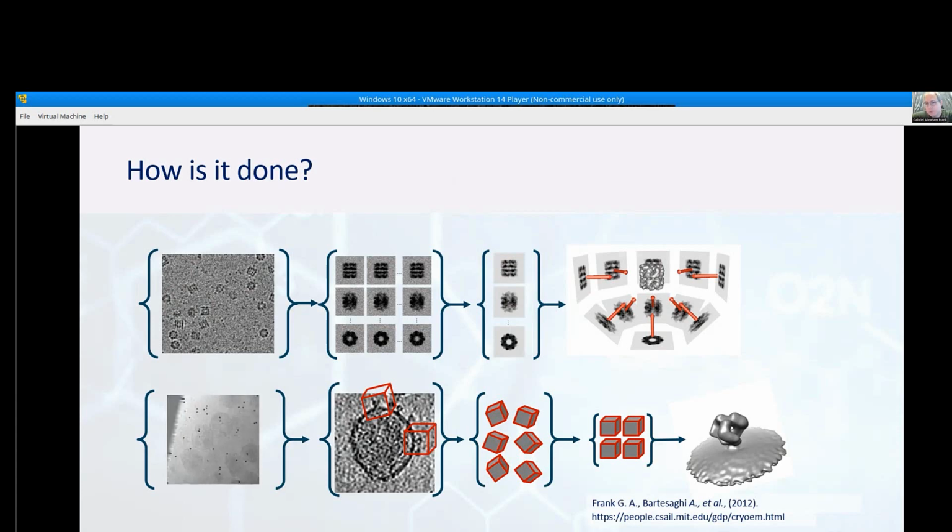I can barely see the people in the room, and now I have to decide which person is which, or which chair has a person in it and which chair is empty. Clearly, as the amount of photons that I'm collecting gets lower and lower, this job becomes harder and harder. So how do we solve this issue? In principle, if I had very clear pictures of the room, for example, it would be much easier to align the pictures to each other than if I have very dark pictures. But I'm pushed to have dark pictures since we cannot collect with high doses. That would destroy the structure.